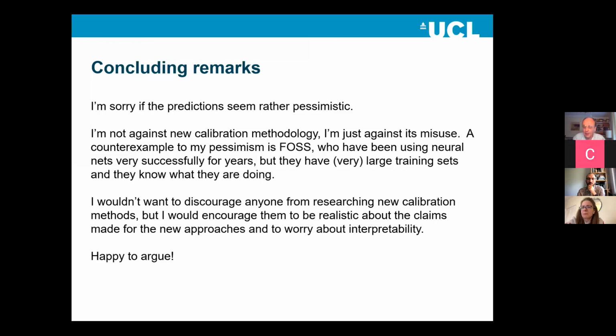Yes, it's not uncommon to have a small number of samples. The expense comes from the fact that to do a calibration, you need reference measurements and you need NIR measurements. Typically the NIR measurements are very cheap, which is why you're trying to develop the calibration in the first place. And the reference measurements often might be quite expensive. And so the limitation on sample sizes of the training set is typically the amount of reference chemistry you can afford.